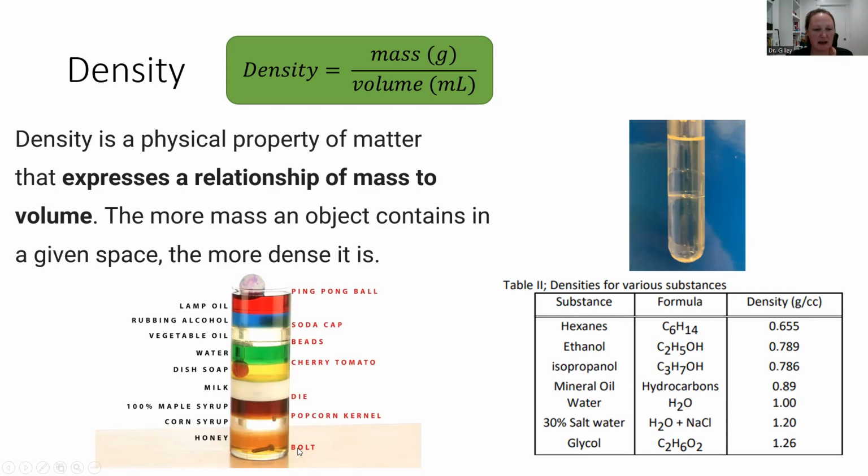And they have carefully layered each liquid one on top of the other. And the one that is at the very bottom is the most dense, and it would have the highest value for its density, right? So it would have a larger number for density than all of the liquids above it, with the red liquid having the lowest density. And then they often will color a lot of these layers to make the distinctions between the layers a little bit more obvious.